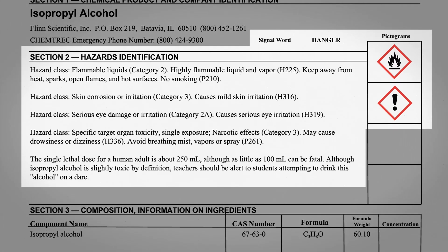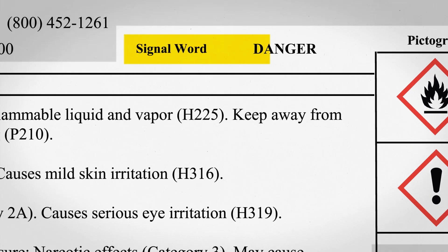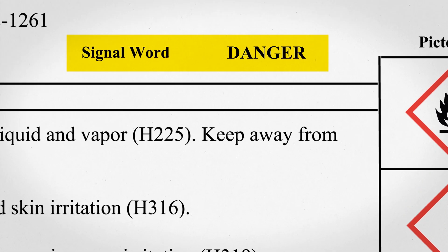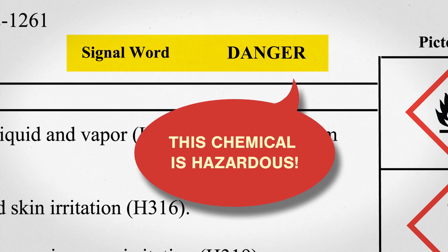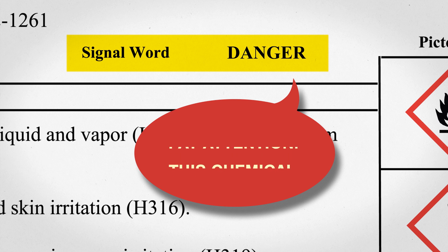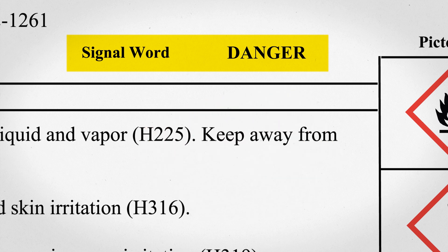Section 2 identifies hazards. Hazards can be identified in three different ways. The first is called a signal word, which serves as a kind of first alert — "Danger" means this chemical is hazardous. Chemicals that are less hazardous may use the word "warning" instead of "danger," while non-hazardous chemicals won't have a signal word at all.